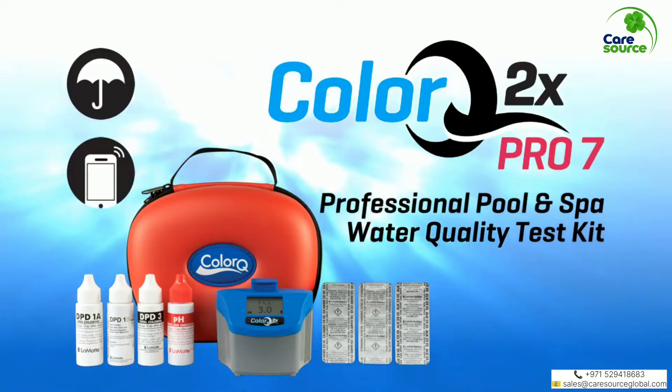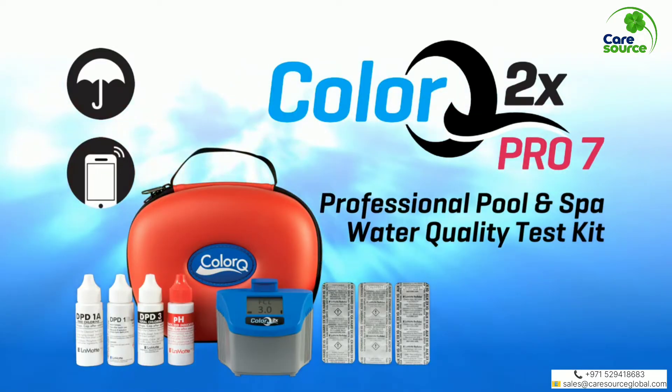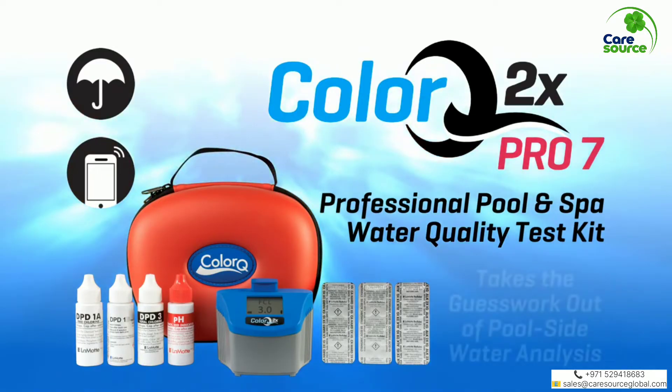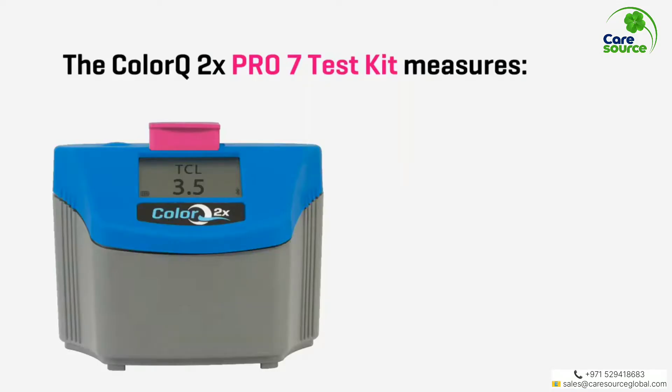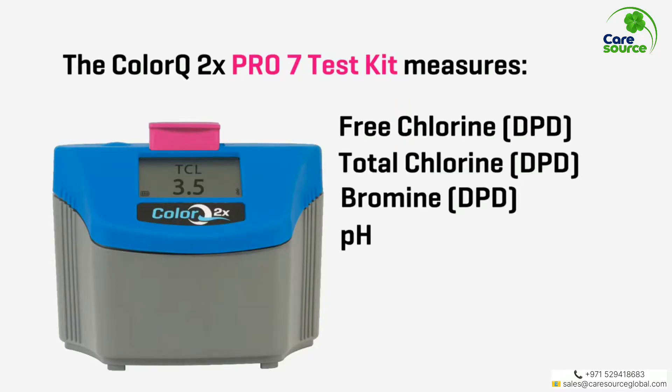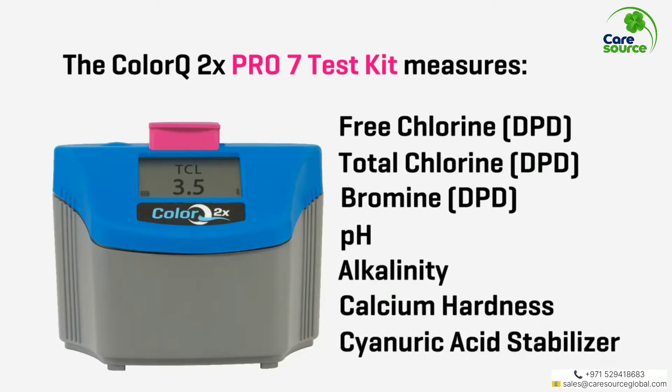The waterproof Bluetooth ColorQ2X Pro 7 Professional Pool and Spa Water Quality Test Kit takes the guesswork out of poolside water analysis. The ColorQ2X Pro 7 Test Kit measures free chlorine, total chlorine, bromine, pH, alkalinity, calcium hardness, and cyanuric acid.